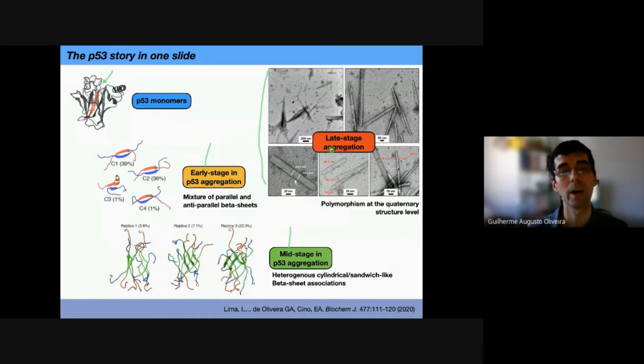I mean, when you have these major fibers. So what we first discovered is that once we have this peptide forming the dimers, you can have a mixture of beta strands that form parallel and anti-parallel organization, as shown in here and in here. And this is the major distribution we have. More interesting than that is that you have this hydrogen bonding that is formed in the main chain, and also in the side chain and side chain interactions. And this is also cool because we can try to understand the strand orientation during this nucleation process.